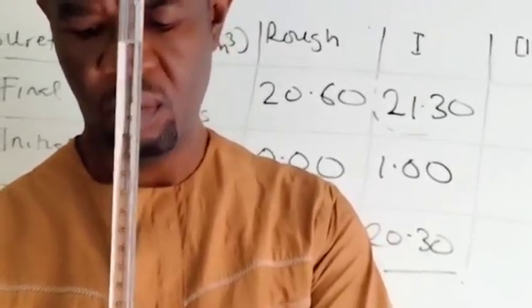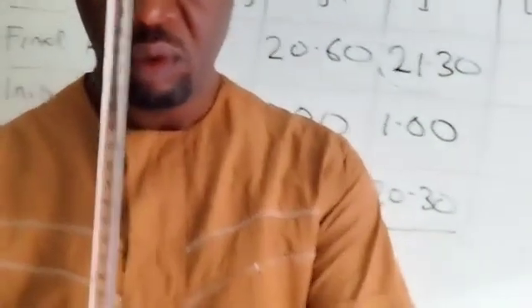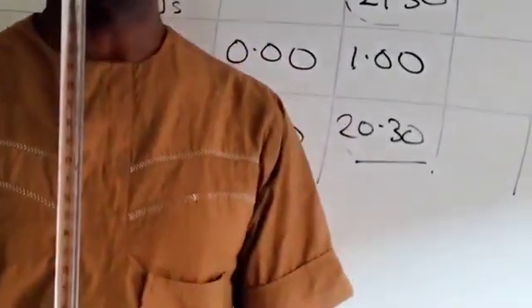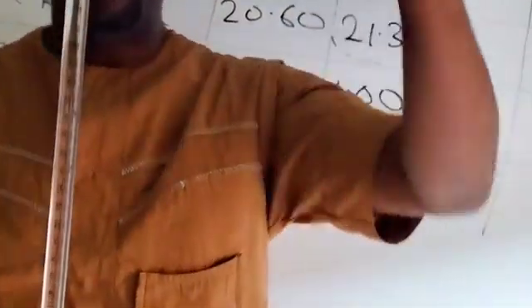So it's there. So I'll close the tap firmly. Okay, it has gone a little below. Let me add more of the acid to make it up to 5. So it's above 5, adjust again. And measure: the bottom of the meniscus sits on 5.